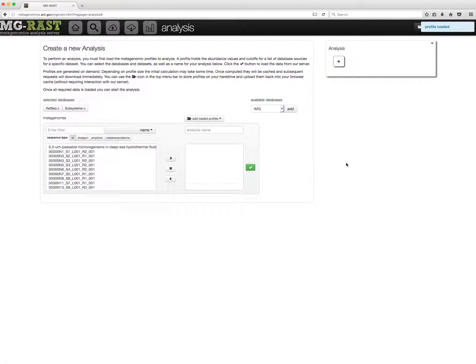Loading profiles from disk should be very fast, though this depends on the number and size of profiles being imported.